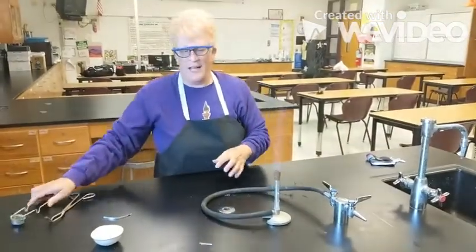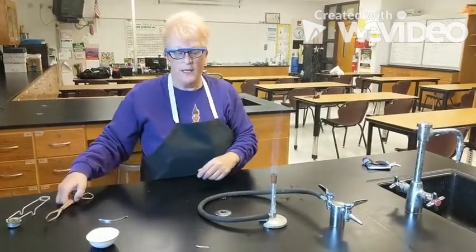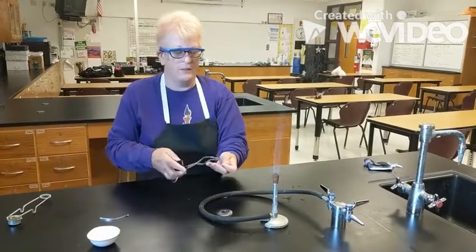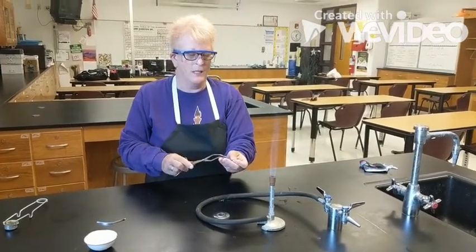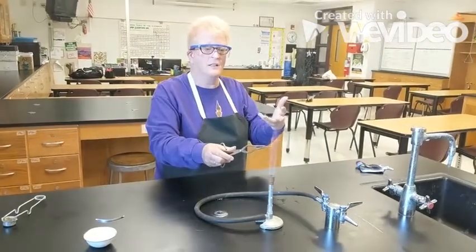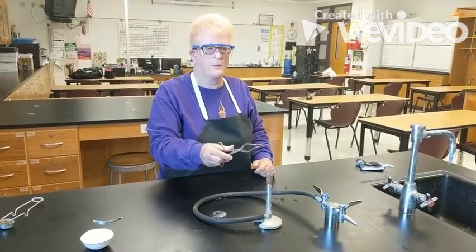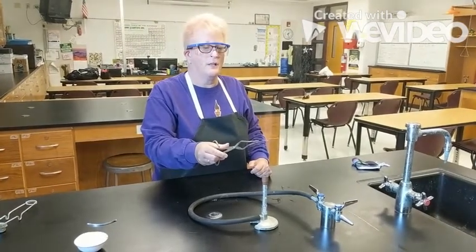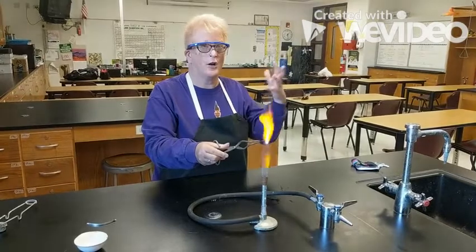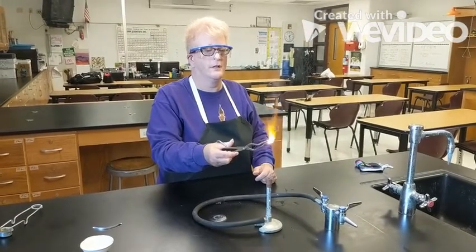The Bunsen burner has a reaction that is burning a gas, just like if you have a gas stove. And so we're going to take this piece of magnesium and put it into the Bunsen burner flame, and we're going to see if that heat has any effect on the magnesium. Any guesses as to what might happen? So we're going to see what happens. There also is air present around here, so that might also be part of the reaction.